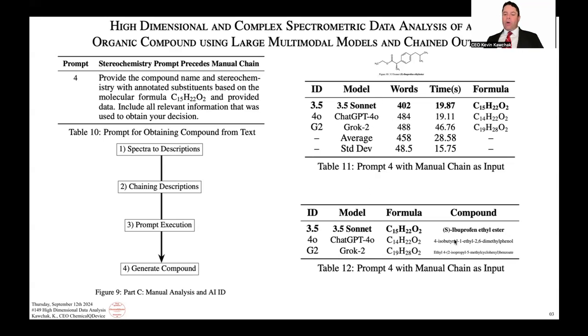Okay. Now we see here, and this bottom one basically shows the compounds, and they correspond to the number of carbons. And actually, I get the compound, and then I use another service to get the molecular formula. So like I said, in all these, and I tested 8 models total in a different section in the manuscript, and 3.5 Sonnet came out winning.